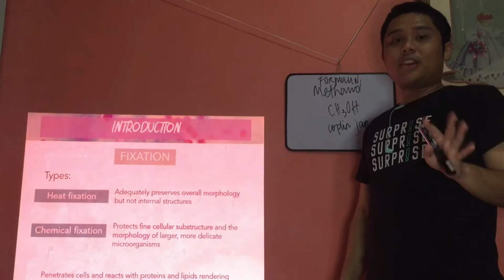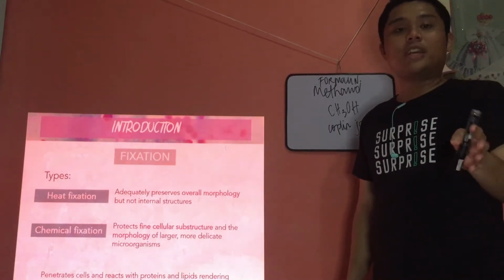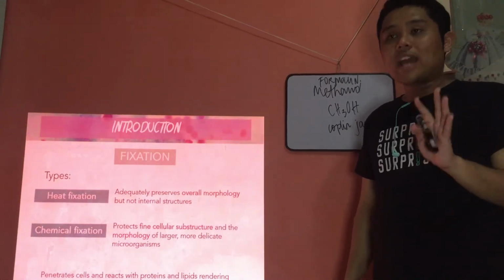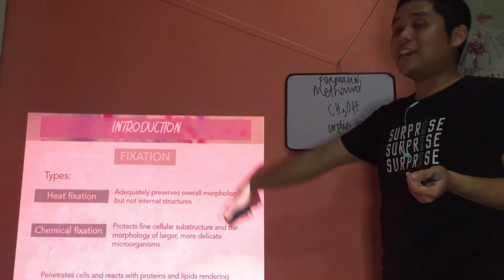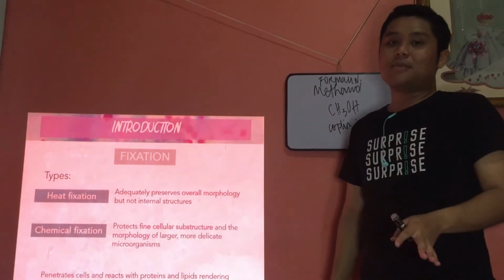Okay, so that's the reason why, again, if you have two specimens, always go first to microbiology. If the request is for both histopathology and microbiology. Why? Because for histopathology or histotechniques, we usually use a fixative or a reagent for fixation, and that is formalin. And formalin kills your organisms, okay?